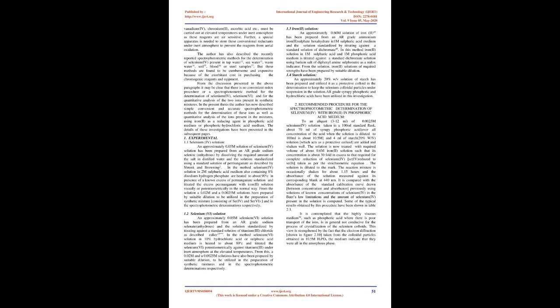The author has also described the recently reported spectrophotometric methods for the determination of selenium(IV) present in tap water 32, seawater 33, wastewater 34, soil 35, blood 36, or steel samples 37. But these methods are found to be cumbersome and expensive because of the exorbitant cost of purchasing the chromogenic reagents and equipment. From the discussion presented above, it is clear that there is no convenient redox procedure or spectrophotometric method for the determination of selenium(IV) and selenium(VI), and for the quantitative analysis of the two ions present in synthetic mixtures.